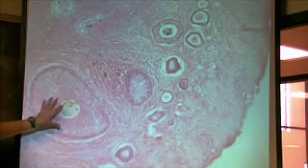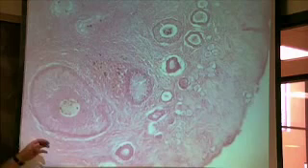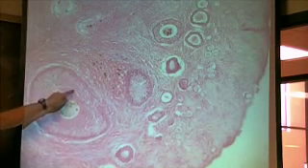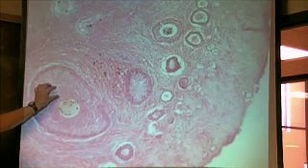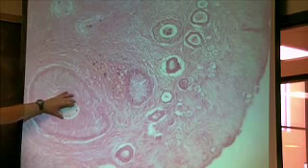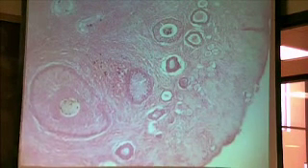This right here is a later secondary follicle. Here's the oocyte, here's our layer of cells. Now what's going to happen here is you're starting to see it. You see this space here between the cells? So that space is going to enlarge, and it's going to push the oocyte off to one side of the follicle.